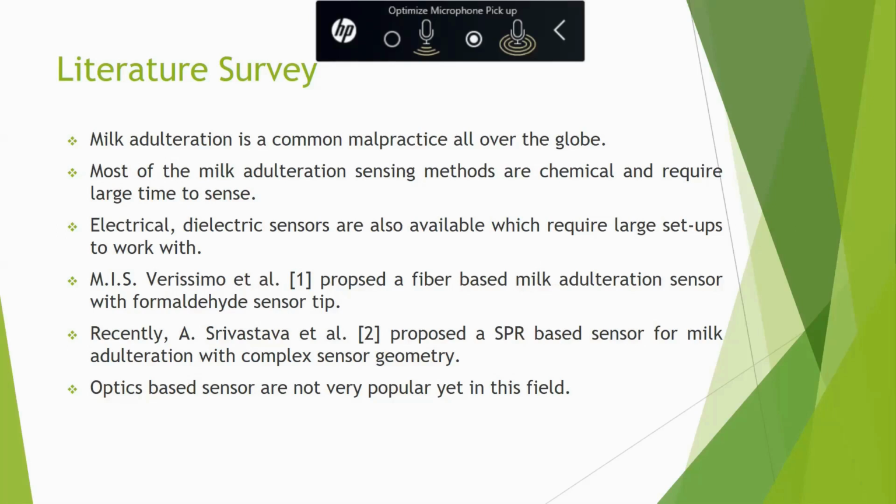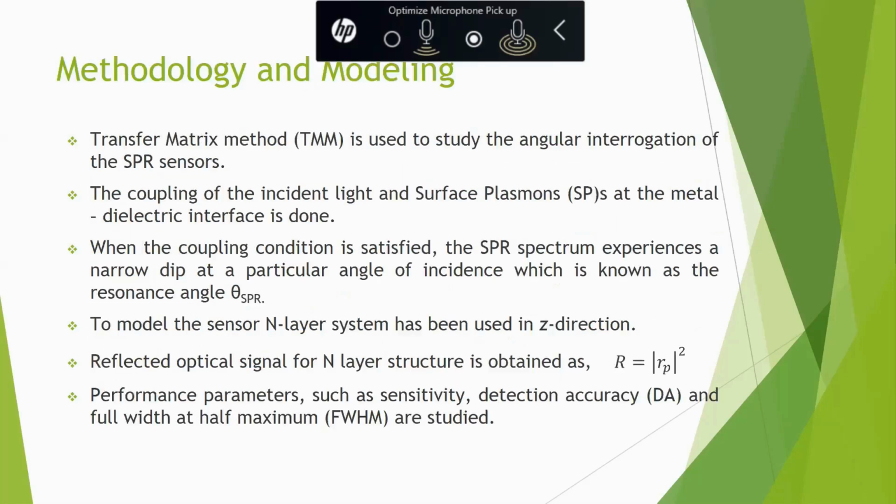So that is why in the case of an optical SPR sensor, if we can have a small prototype of the device, they don't have to work with chemicals. Just by seeing the reflected light, they can see. So this is a theoretical study.